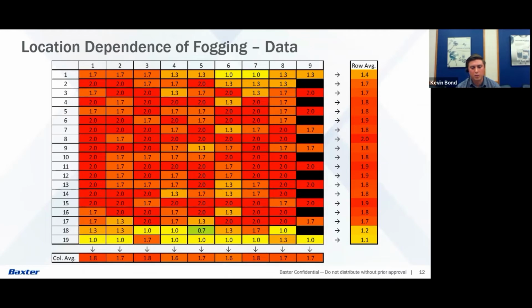There, of course, were some vials located across the cycles, in the center, which didn't have as severe fogging. But again, just on average, the front 2 rows and the back row had lower fogging than vials which were located in any of the center rows.